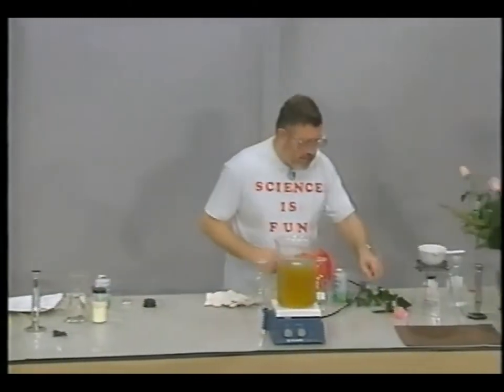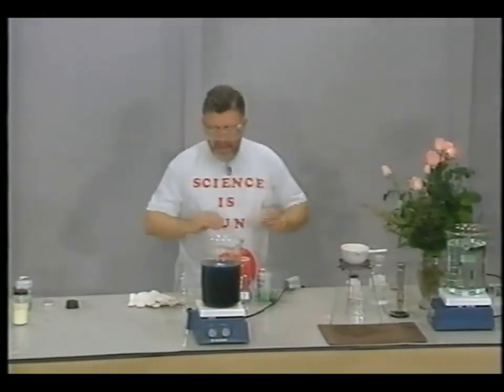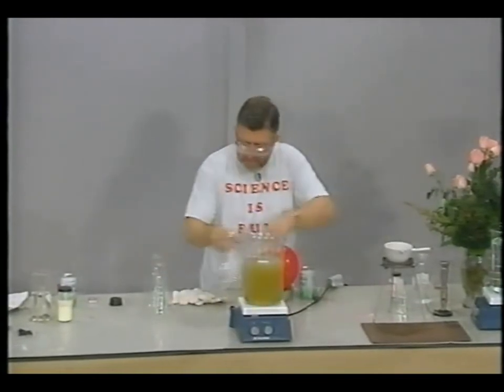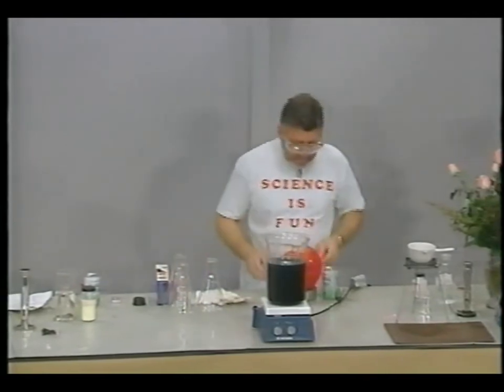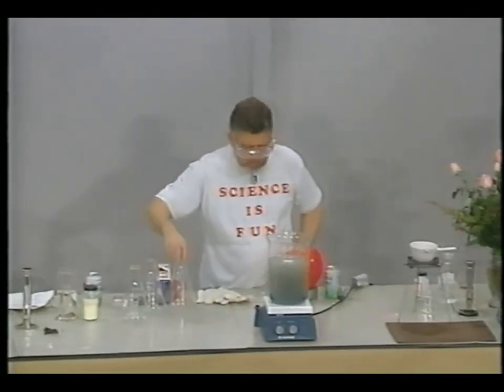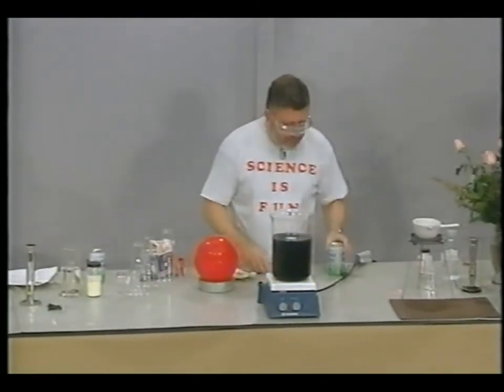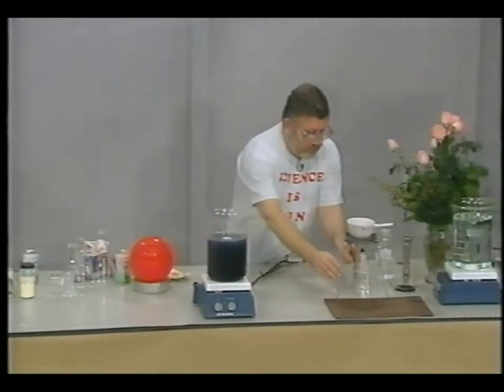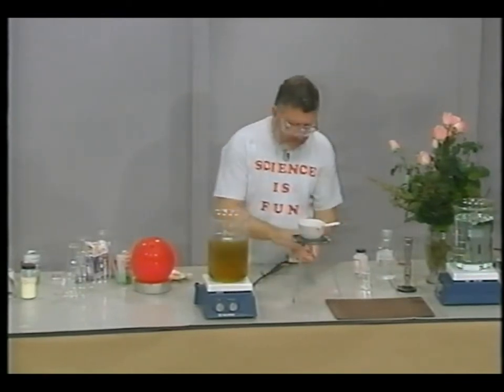All right, so let me now do another experiment at this end of the table. I know you're fascinated by the color changes that are taking place here, so we'll keep an eye on that, and we'll see how long these oscillations last. One of the things that we're going to do is to see if we can make some additional chemical transformations. These chemical transformations we're going to try to do using some copper pennies.